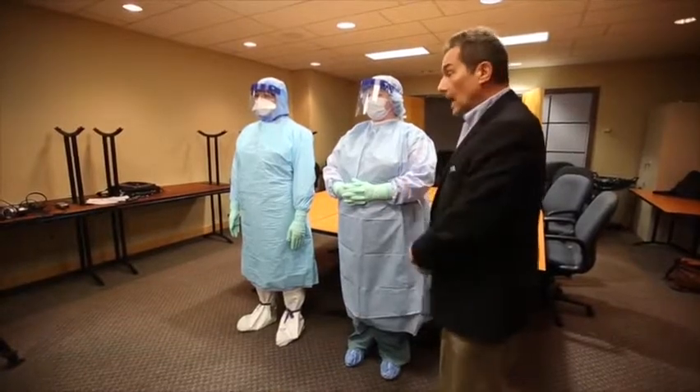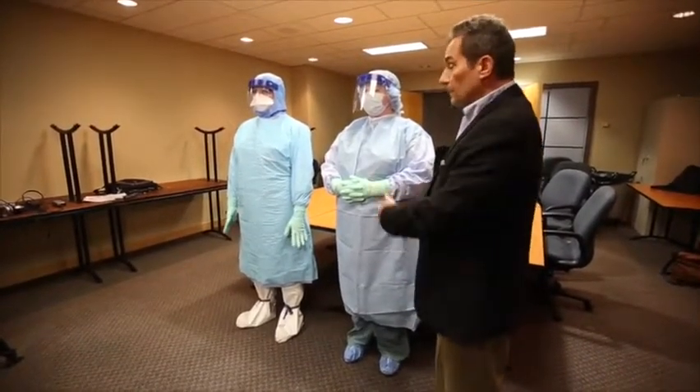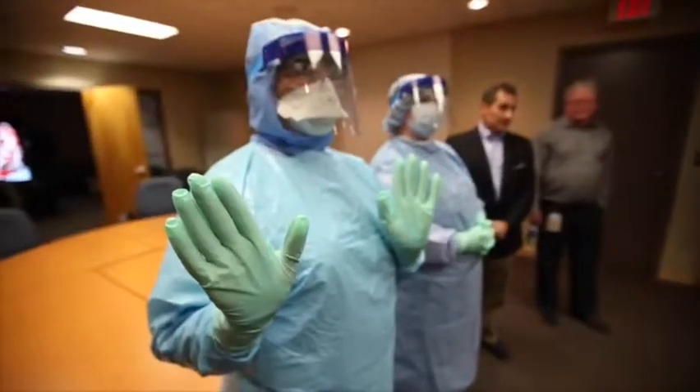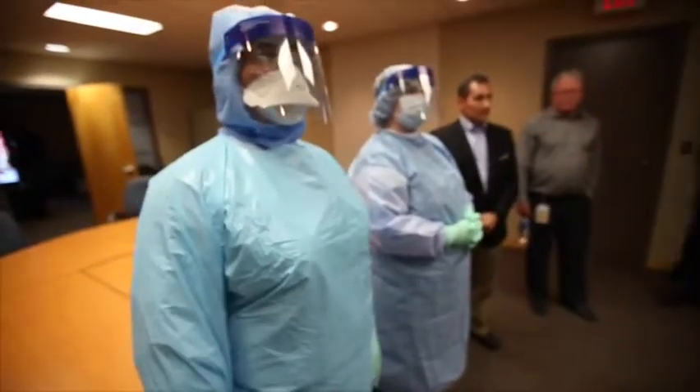We then have a gown that is fluid impermeable. Over top of that we have the apron, which is also fluid impermeable. We have two pairs of gloves, and working down we have shoe and leg covers.